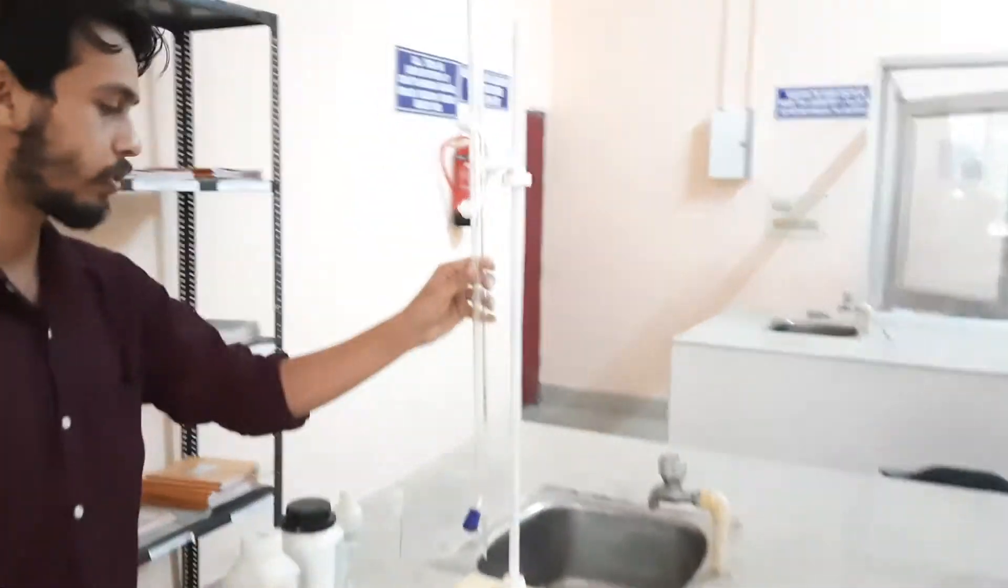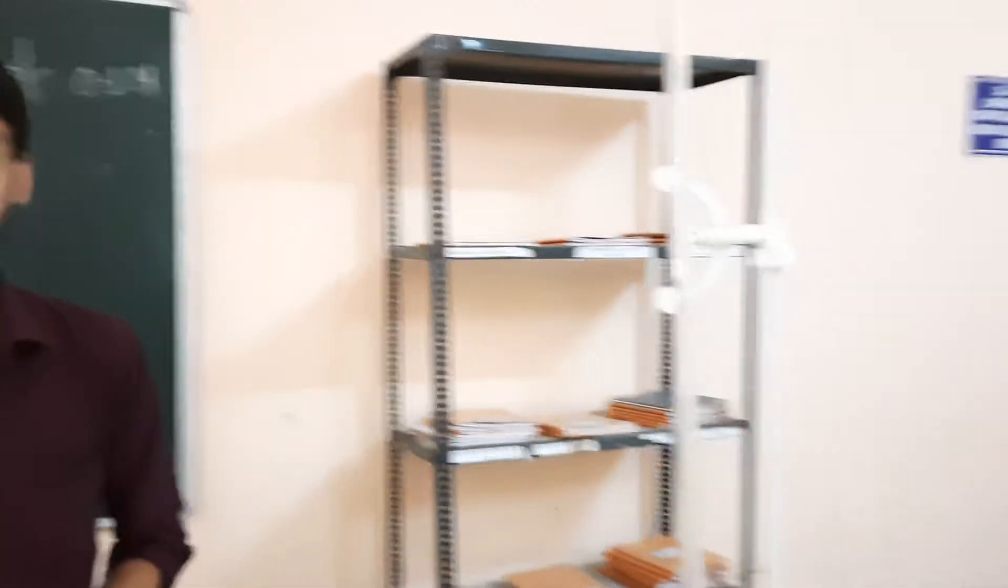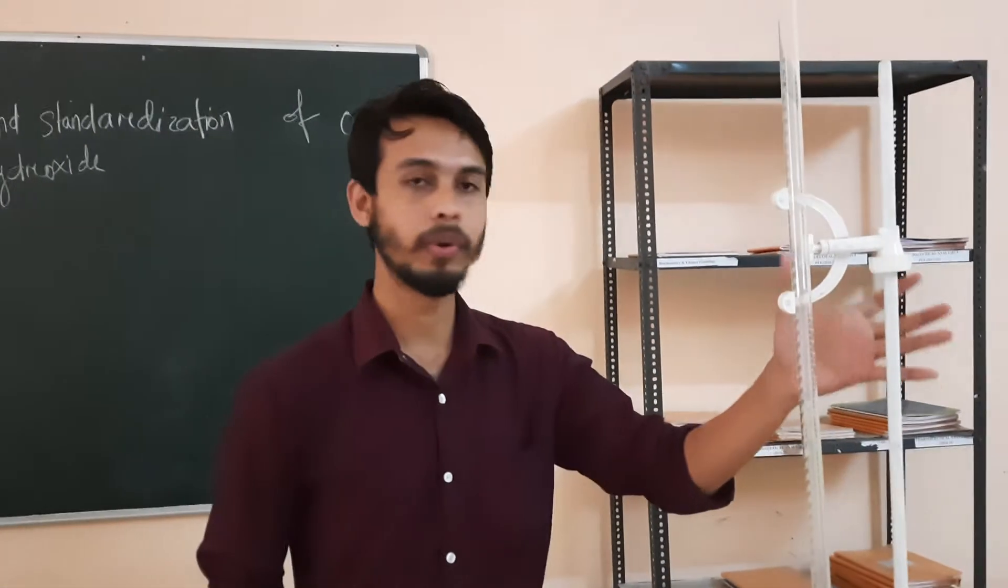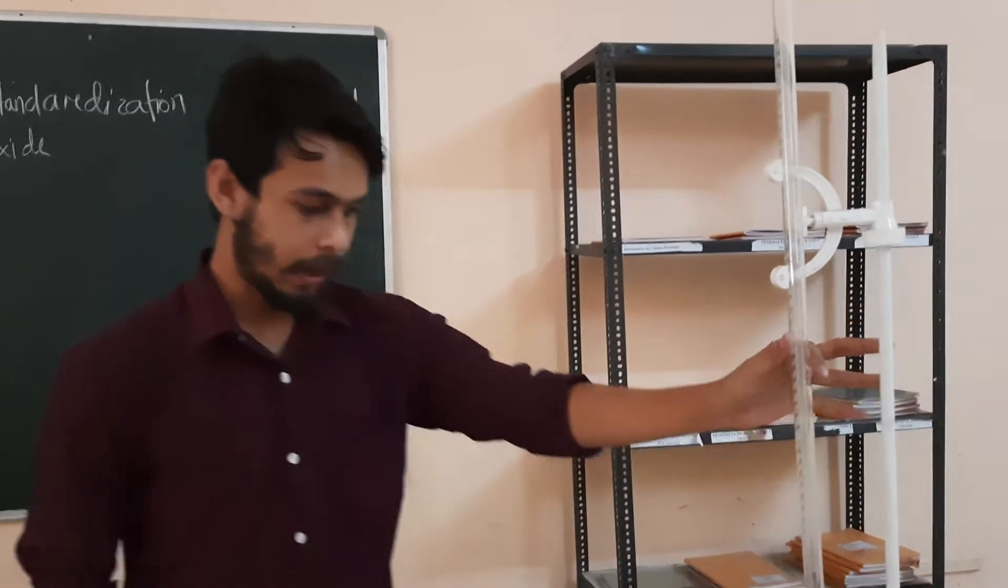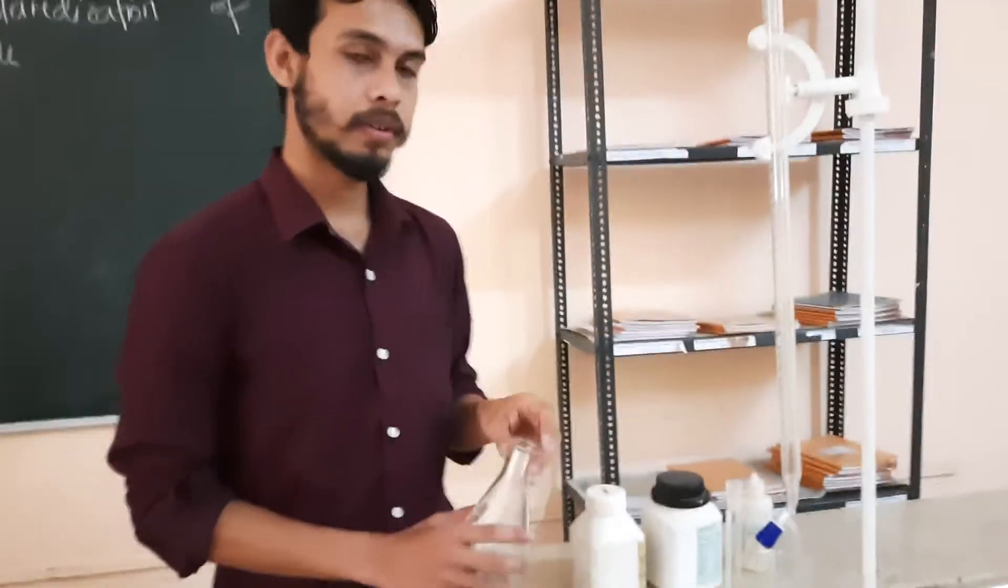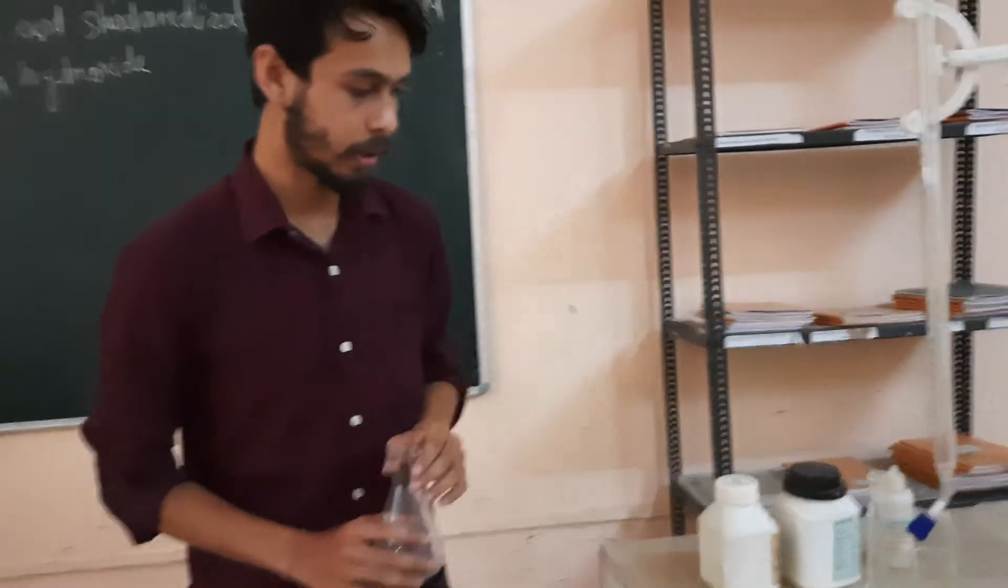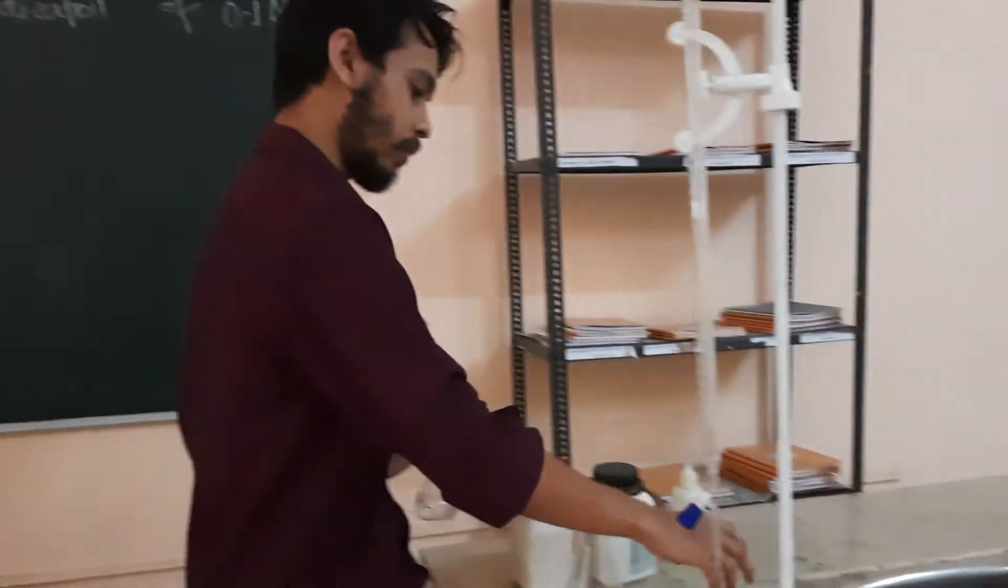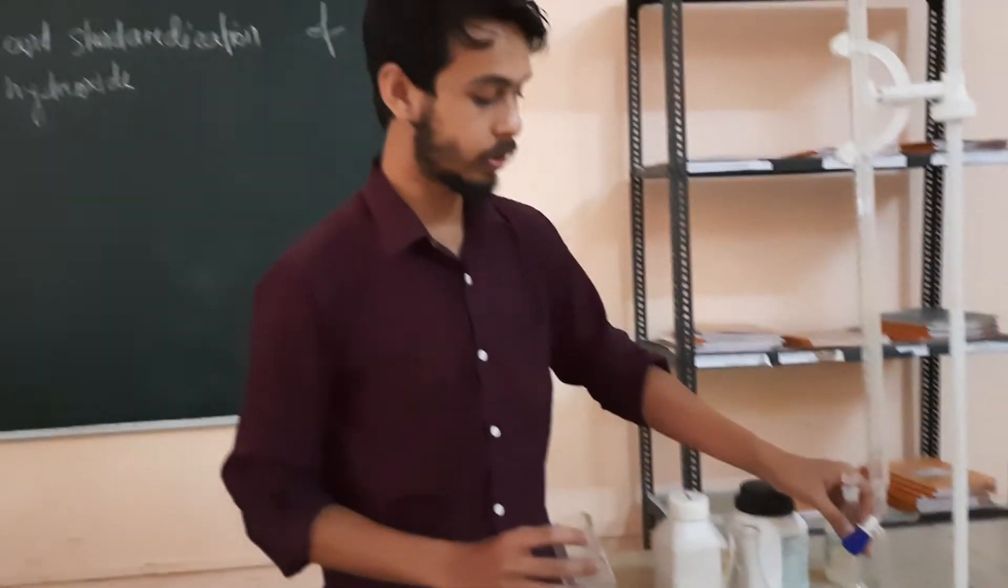This one is burette. All of you know this one is the burette. We are going to perform the titration. So this is the burette. This is the burette stand to hold the burette in a position. And this is the conical flask. We need the conical flask, the volumetric flask, and a beaker for the preparation of the solutions.